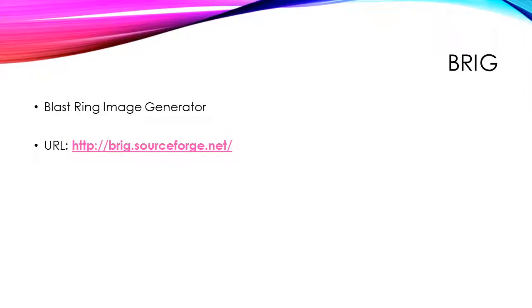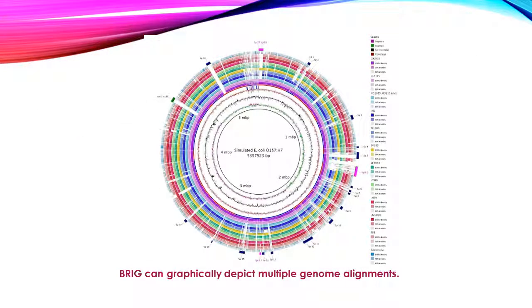BlastRing Image Generator, or BRIG, available at the provided link, offers software which enables the visualization of genomes. You can compare one or more genomes with your reference strain and obtain a ring-like output. BRIG is a useful tool to obtain a snapshot of the genome — discontinuous regions are represented as white missing gaps. Once you obtain this figure, you can zoom in on a particular discontinuous region and look more deeply into the genes which are missing or have been acquired by each of the genomes.